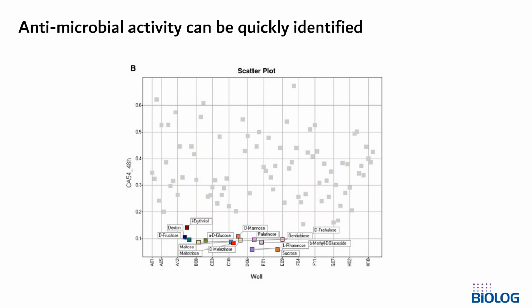So we can see from these experiments that the preferred carbon source can be decoupled from the carbon source that will allow for the highest yield or titer of our product of interest.